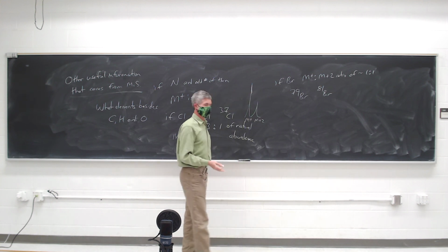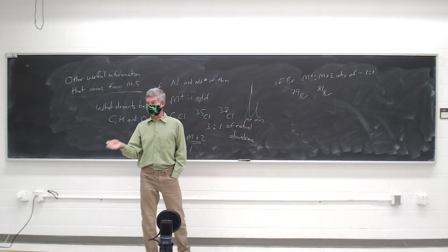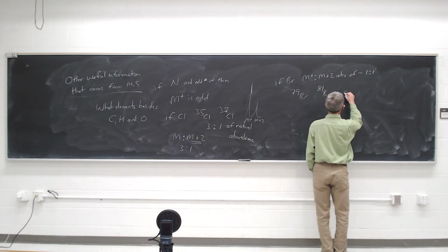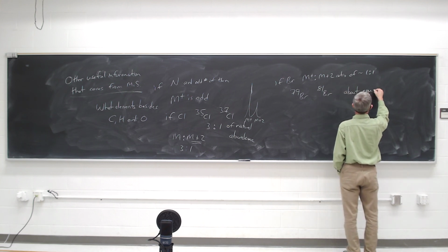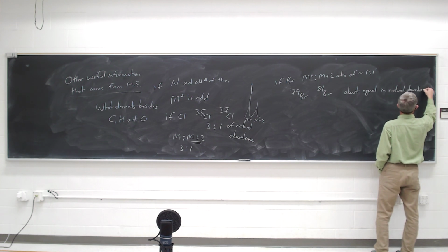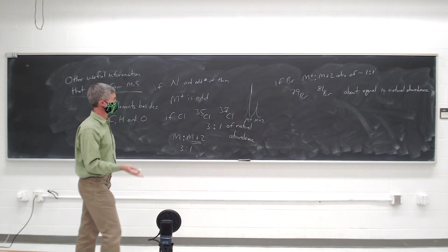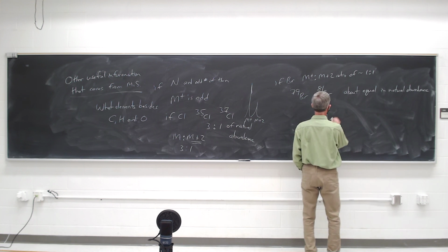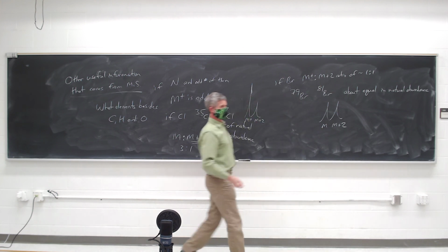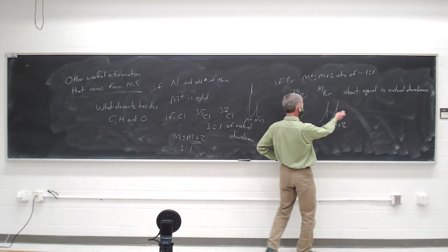Right? So if you look at the periodic table, bromine has an average atomic mass, or weighted average mass, of about 80. But no bromine atom has an atomic mass of 80. They're either 79 or 81, and since the natural abundance is about equal, there's approximately a 50-50 chance that your molecule has a 79 bromine in it or an 81 bromine in it, so you're going to see a distinctive pattern where your M and M plus 2 look about the same height. If you have more than 1 bromine, you're also going to see a really distinctive pattern.